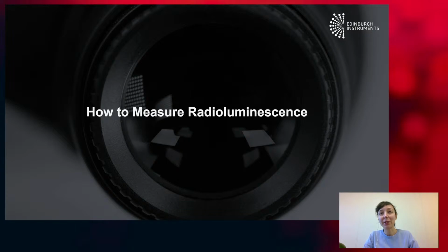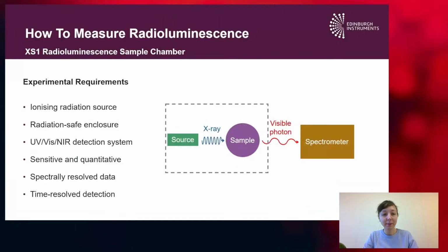Thank you, Tommy. That was a very interesting introduction to radioluminescence. So now that we know how the mechanism works and we know what it can tell us, I'm going to give an introduction on the experimental techniques that we use to measure it. So what do you need to measure radioluminescence?